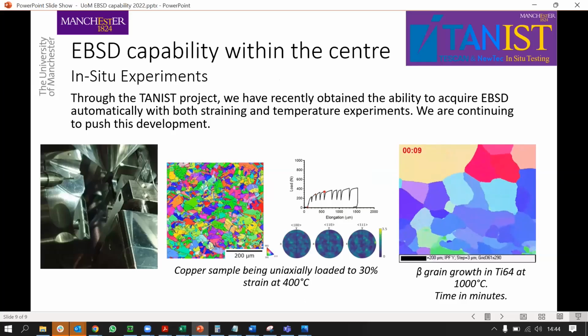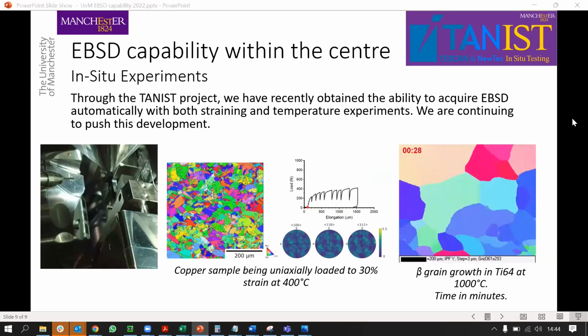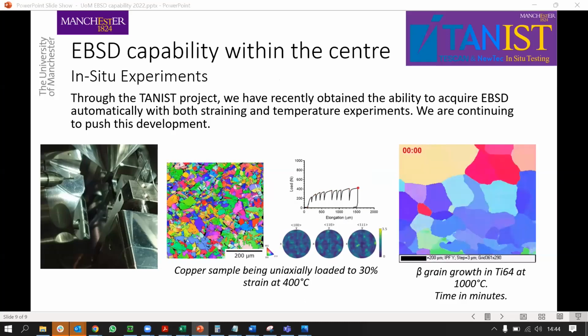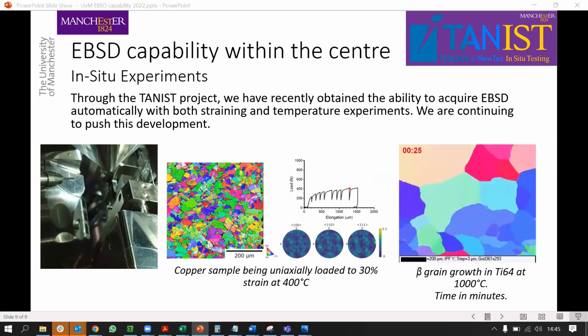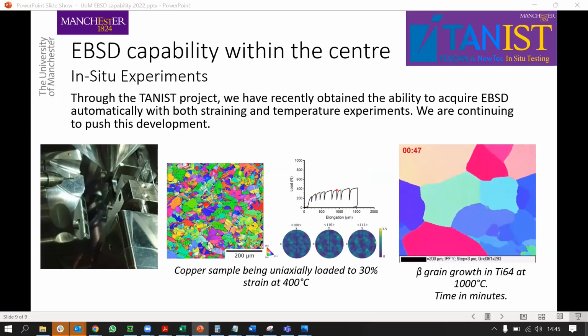And finally, and this is my kind of bag, I like my in situ studies, partly because it means I get to put together nice little animations. These days, this is mainly taking place on 2 microscopes we've bought solely to do in situ studies, and we've only recently moved towards integrating EBSD with those.